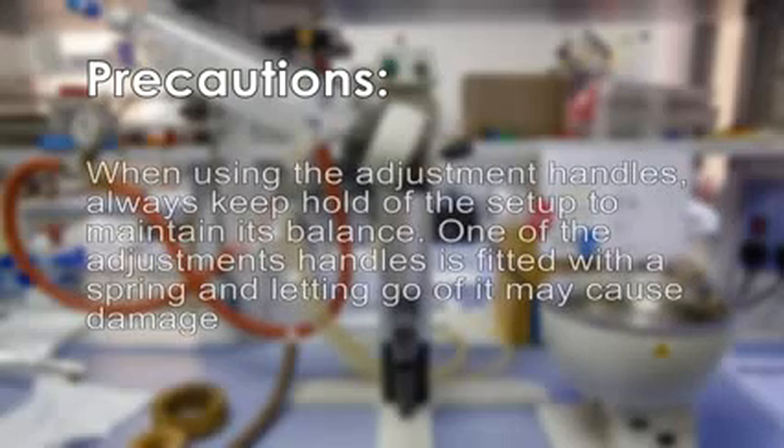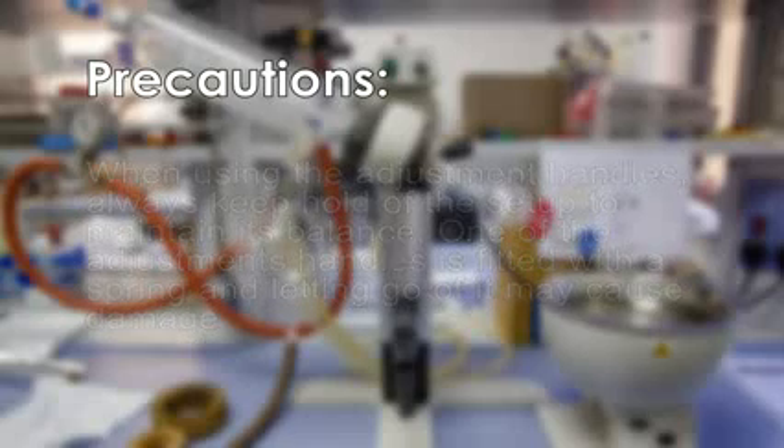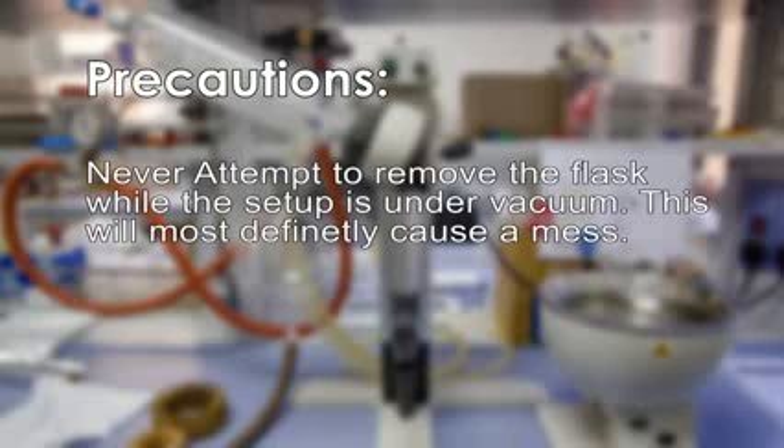When using the adjustment handles, always keep hold of the setup to maintain its balance. One of the adjustment handles is fitted with a spring and letting go of it may cause damage. Take care not to mix halogenated and non-halogenated solvents during disposal of waste. Never attempt to remove the flask while the setup is under vacuum, as this will most definitely cause a mess.